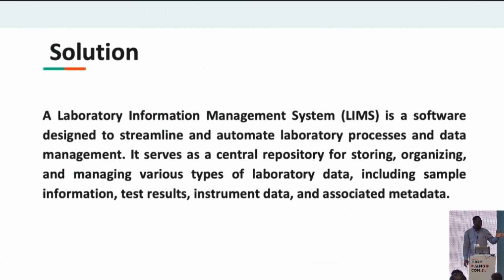A LIMS should also be able to store data. Okay, this sample from patient A, he has cancer, he has a rare disease, what was the result analysis? Like in pathology, it's easier for them to tell you, okay, the result is ABC, but for genetics, it's a different ball game. So you should be able to store your results analysis, and you should be able to have the sample metadata. For each sample, you should be able to know the quantity and the sample type, maybe it's blood, maybe tumor, maybe saliva, whichever sample type. Those information should be stored in a LIMS for your sample.